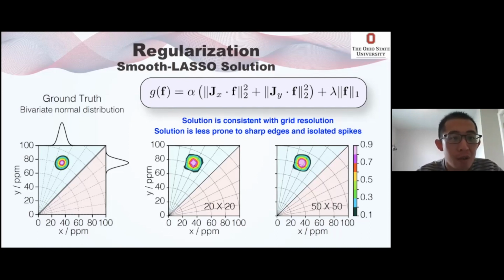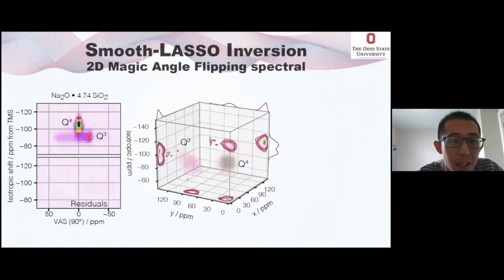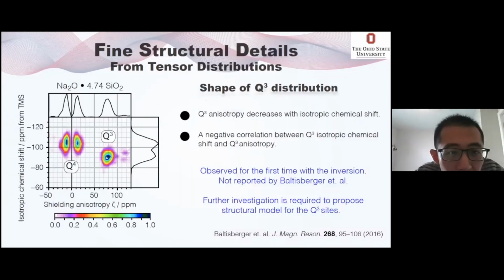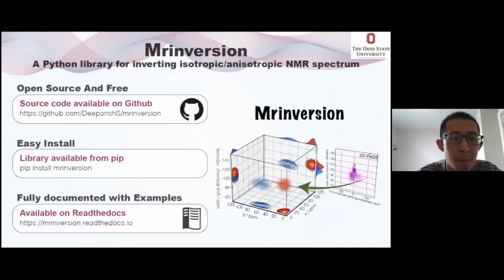On the rubidium nitrate data, you end up with mostly 3 sites, which is what exists in the crystal. But do you know why there are extra regions of non-zero probability? Artifacts, maybe impurities?